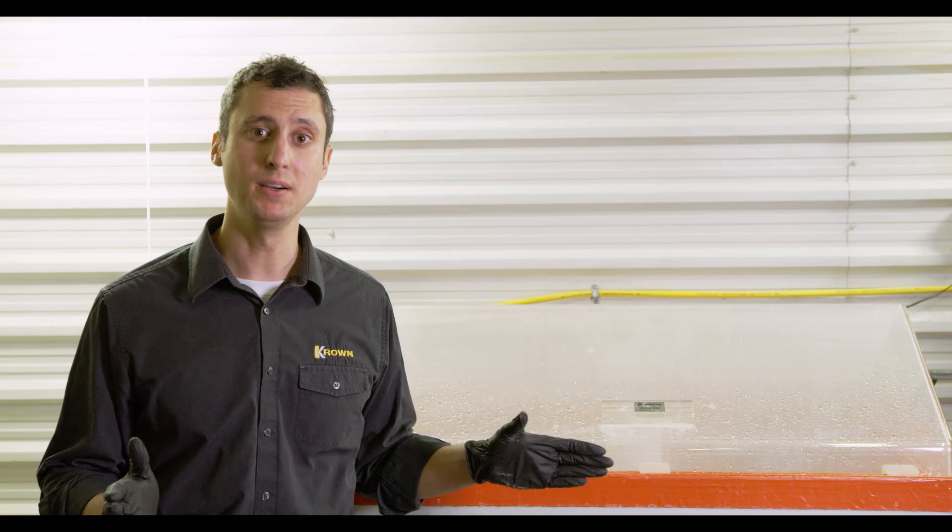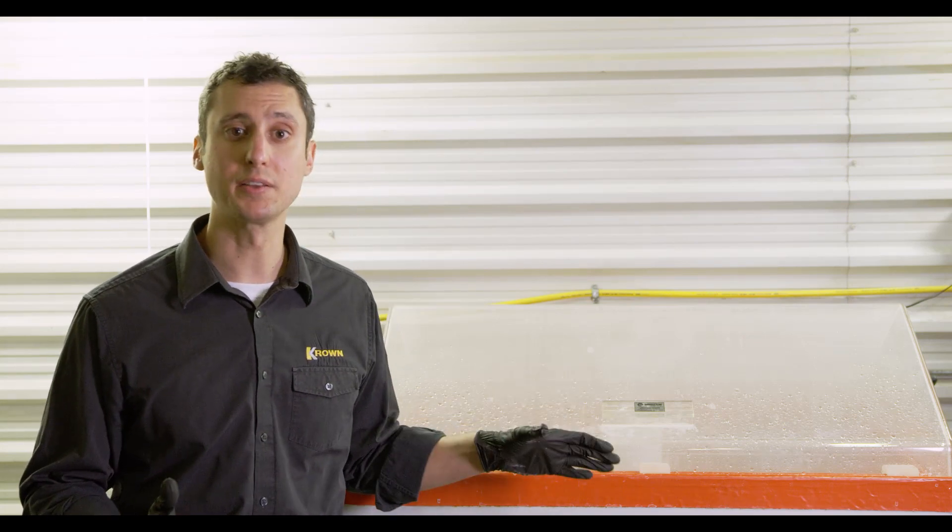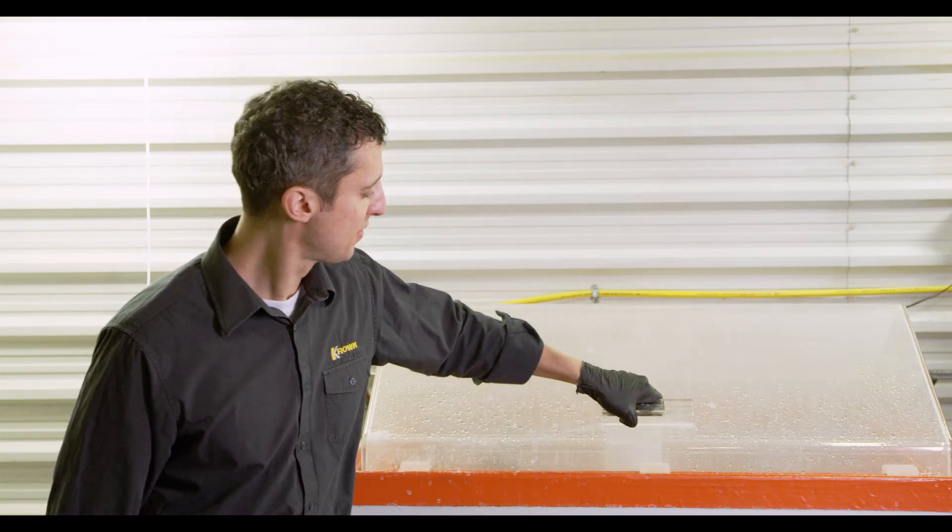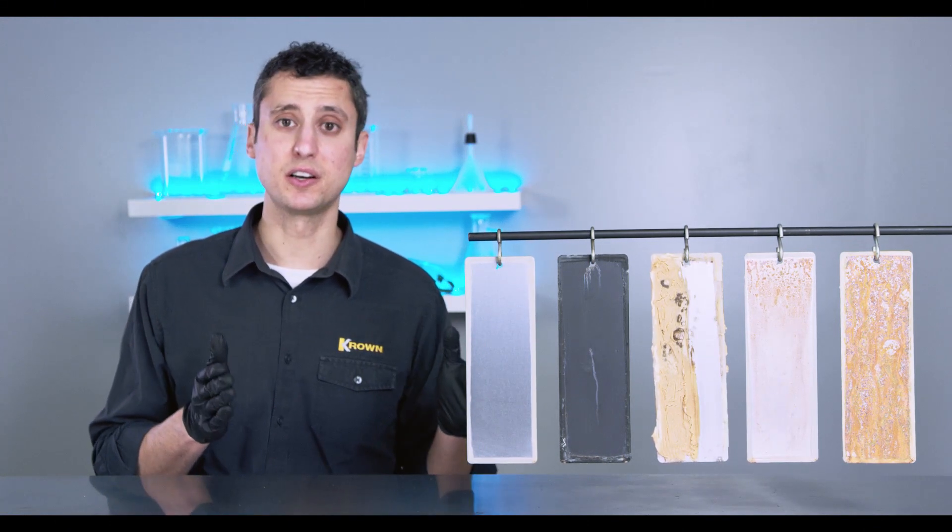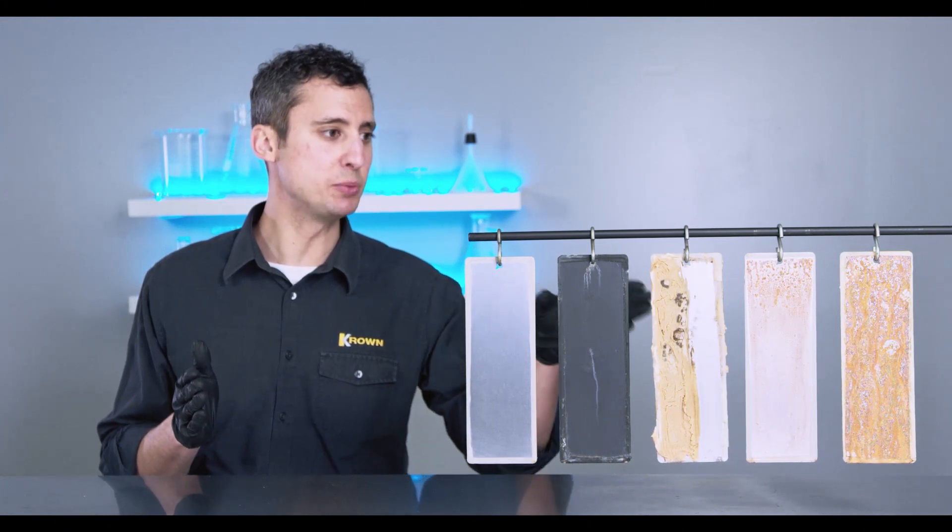It's been 72 hours since we put our samples into the salt spray chamber, so we're going to open it up and take a look at the results of our test. We're back here in the Crown labs and let's take a look at our samples. Let's look at each panel one by one.